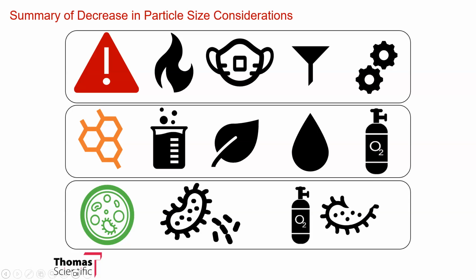If you are doing any processes where you're going to have to filter, or the particles are going to have to pass through an area, it could gum up any gears if you're using a mechanical type of grinding unit, or it might stop up any filtration that you might be doing with it.